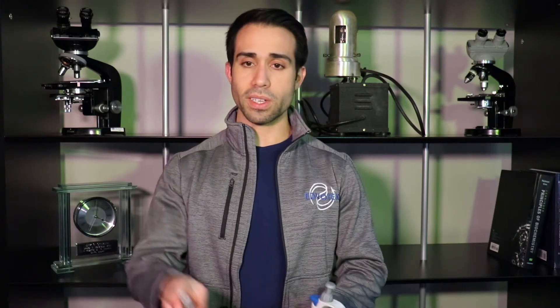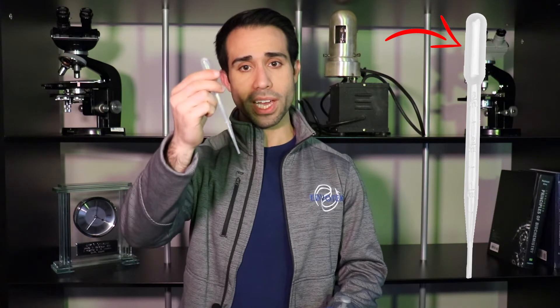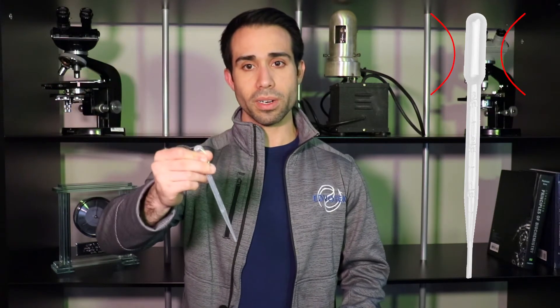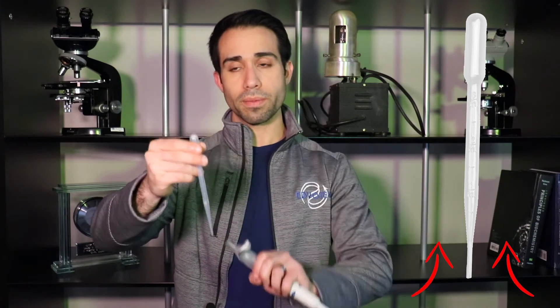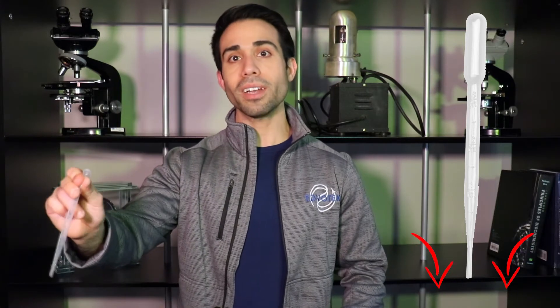A basic pipette consists of a conical tube with a bulb on the end. Simply take the tip, dip it into the liquid, release the bulb, and the liquid will be drawn into the tube. To move the liquid, simply take it, squeeze the bulb again, and it'll be dispensed. Simple.